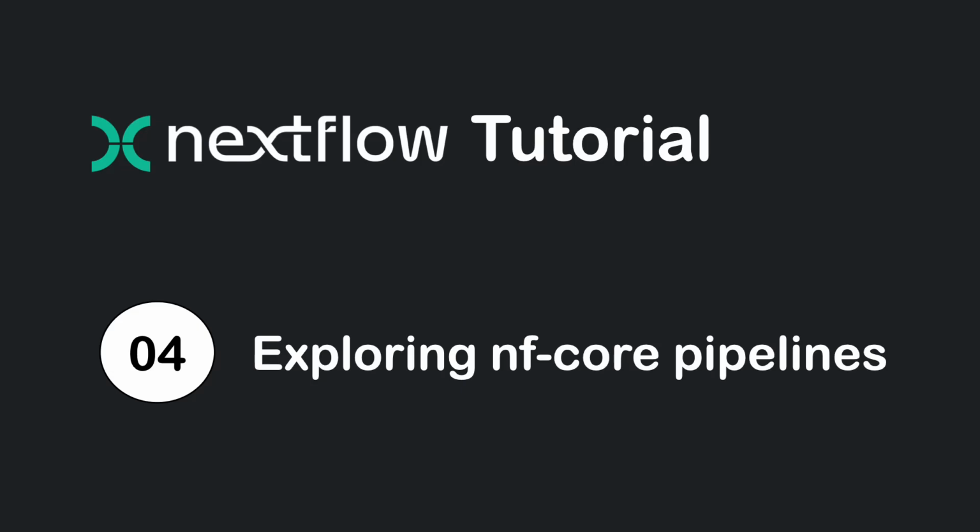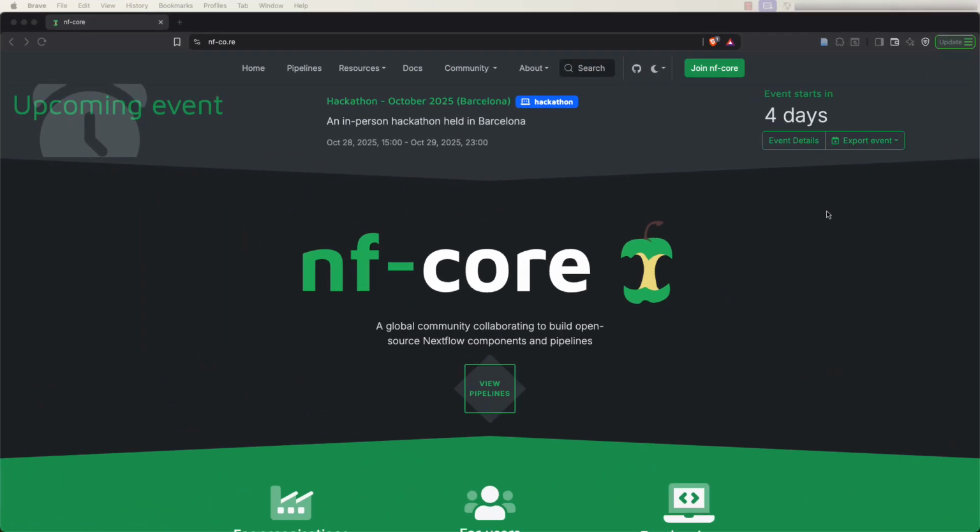Hey everyone, welcome back. In the last video, we installed Nextflow and Conda, and today I want to introduce you to a collection of best practice pipelines you can run with these tools, a community project called NFCore. Let's get started. So what is NFCore?